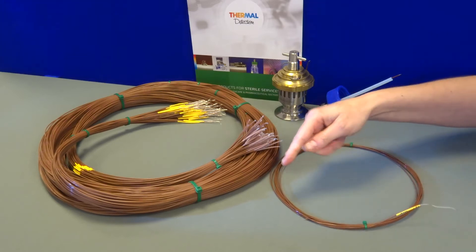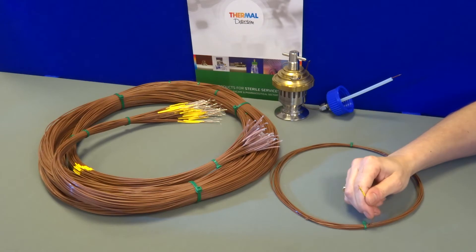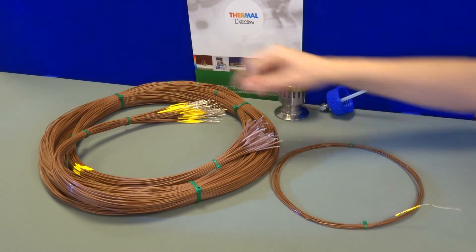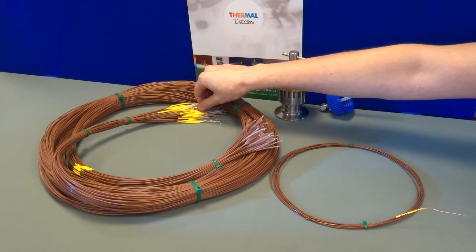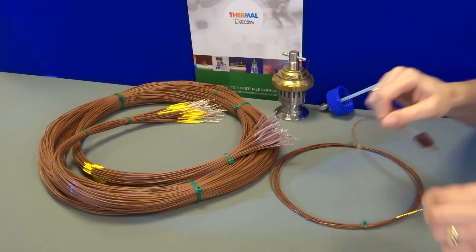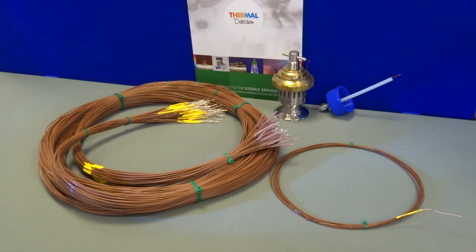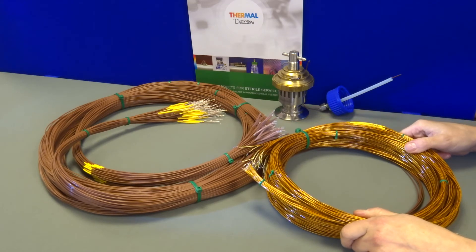The validation thermocouple is available at any length and comes in various conductor sizes, from the single cores to the stranded for more mechanical strength. For insulation, we have PFA extruded, PTFE lapped, and Kapton for high temperature applications such as drying ovens.